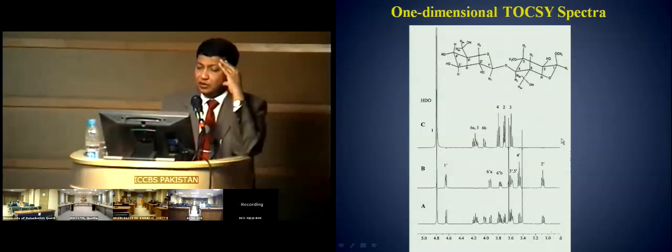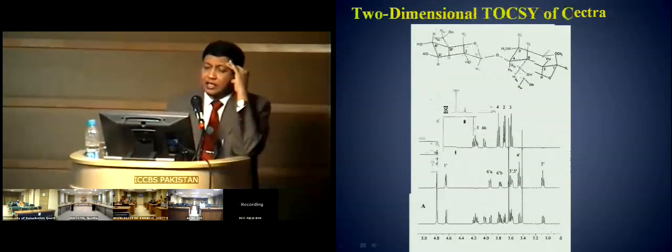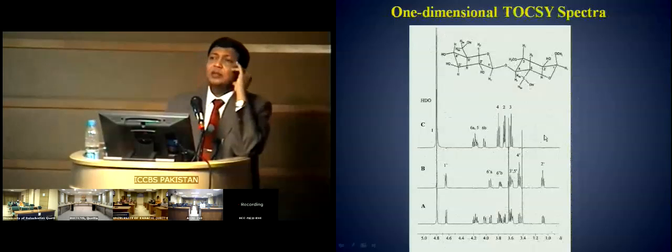In 2D NMR spectroscopy, you just select a contour, the series of peaks like this. This is a series of peaks. And you just tell them to cut this piece for you, and cut this piece for you, and then record it as a separate NMR spectrum.